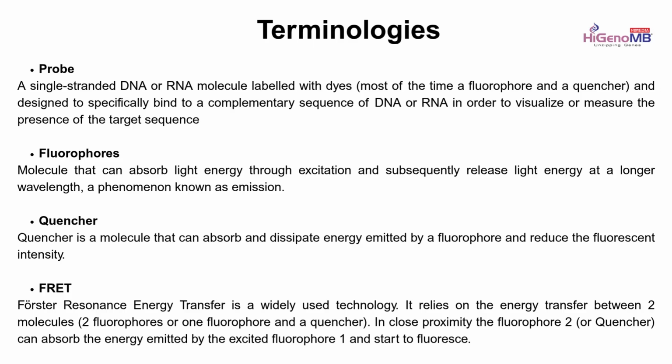This is achieved by a technology called Förster resonance energy transfer. Here, when a fluorophore and a quencher are in close proximity, the fluorescence emitted by the fluorophore will be captured or absorbed by the quencher. But when the quencher is away from the fluorophore, this absorbance of energy by the quencher will not happen.